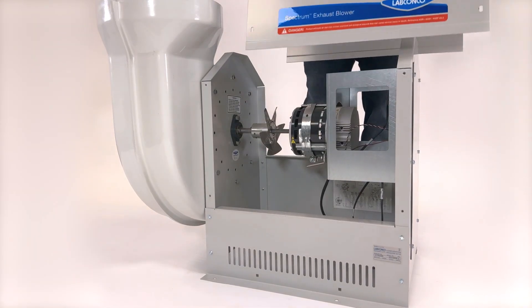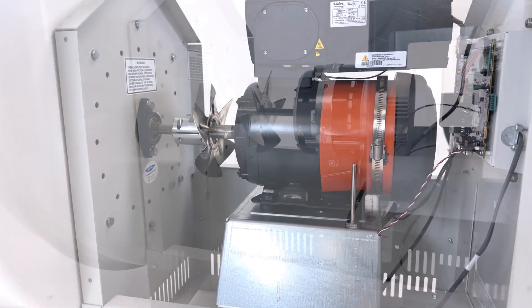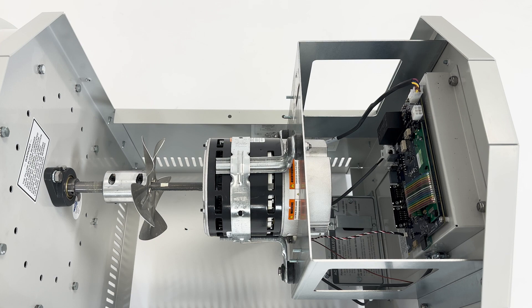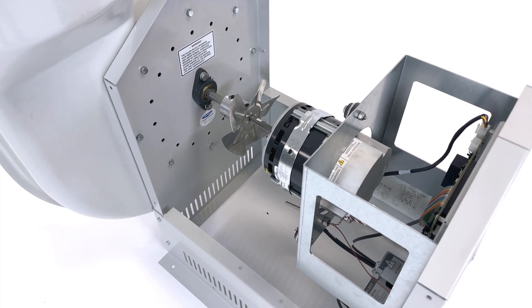With both one and two horsepower models available, the Spectrum blower can support airflow requirements for almost any fume hood or other laboratory ventilation equipment that requires exhaust.